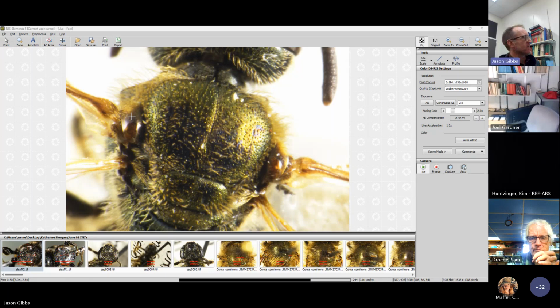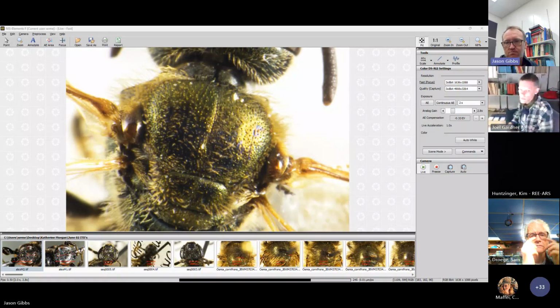It's got a distinctly flat appearance right across the parapsidal lines, and the punctures are very fine between the parapsidal lines and the tegula. So you can distinguish a versatum from a callidum from a trigeminum just by the scutum, because it's slightly different.